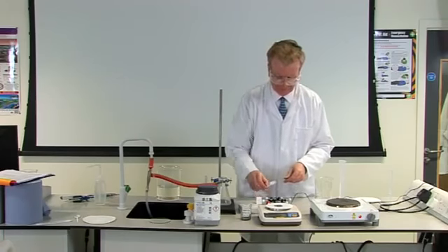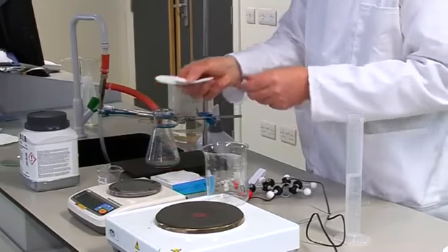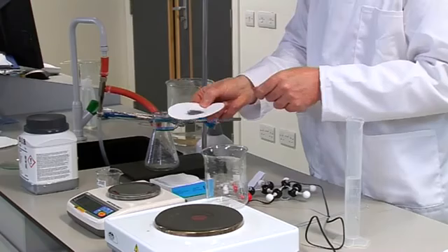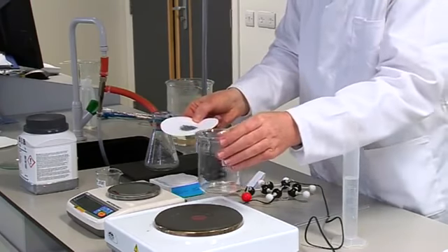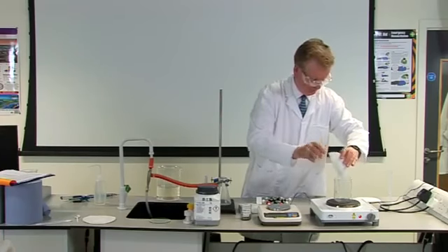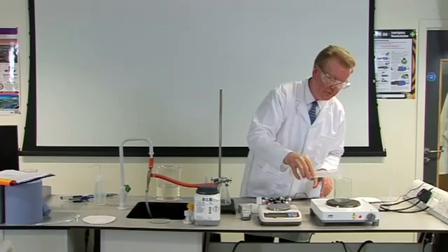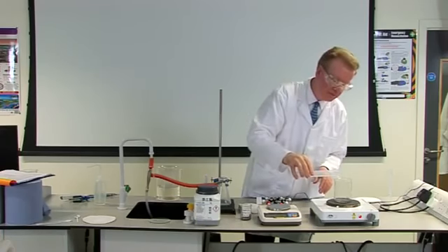The term recrystallization is used because we are starting off with the crystalline material, removing the impurities, and making new crystals. The sample of benzoic acid you see here is contaminated with charcoal. Place approximately 1 gram of benzoic acid in a beaker. Using a graduated cylinder, add about 10 cm³ portions of water to the beaker. Place the beaker on a hot plate and boil the water.